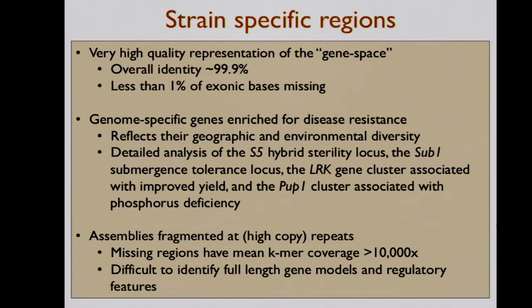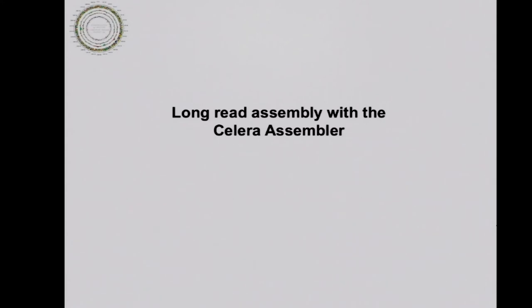So as a result of that, even though that first pass we applied with Illumina sequencing, we've actually gone back and done PacBio sequencing to try to fill in a lot of those holes. And in particular, the way we're going to do this is going to be with the Celera assembler.